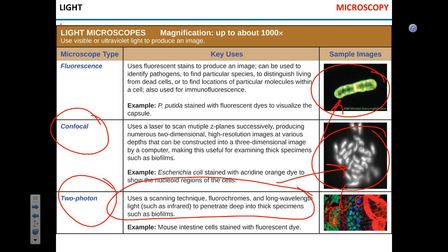So you can have a multicolored image and you can distinguish, saying, okay, this is, I don't know, Pseudomonas, this is E. coli, and this is Bacillus, whatever. Does that make sense to you? So this is really top-notch, state-of-the-art technology. The only problem is that it costs a lot of money.